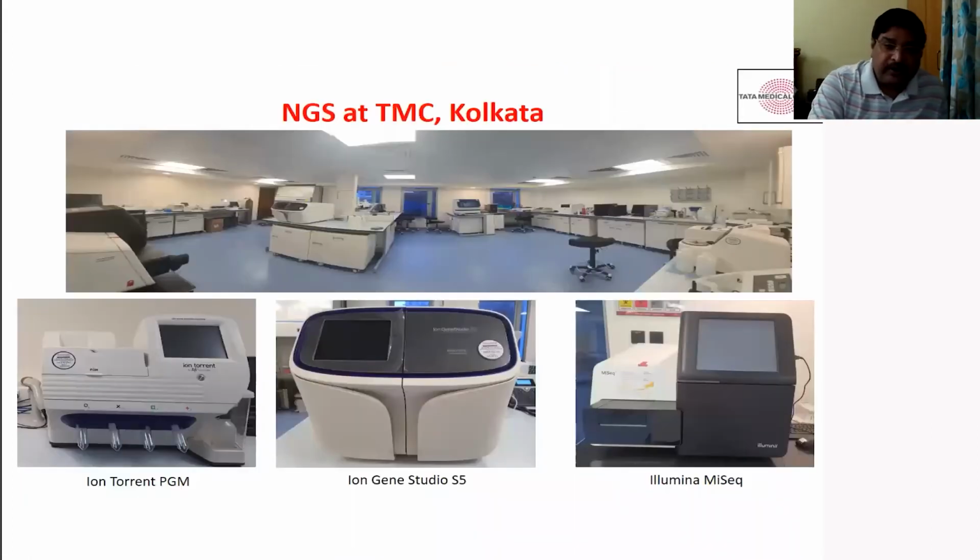So this is how our NGS lab looks like. We have the Ion Torrent PGM, which is a Thermo platform, Ion Gene Studio S5, which I just showed you. This is also from Thermo. And this is the Illumina MiSeq. We have three next generation platforms in the laboratory, and we use them for solid tumor and liquid tumor molecular genetic analysis. Next.